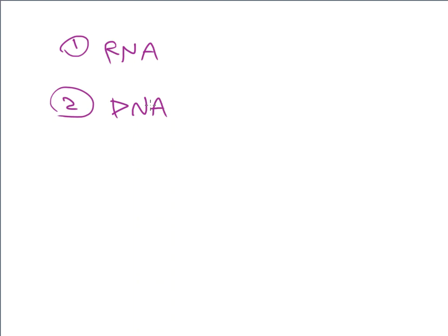That's what this is all about. So DNA is appropriate to run in electrophoresis, just as RNA is. I very often call them the brother and sister of the genetic world. They go along together and are related in some form or fashion. One does a job and the other one does a different job, but they are very similar, not identical. They grew up in the same family.